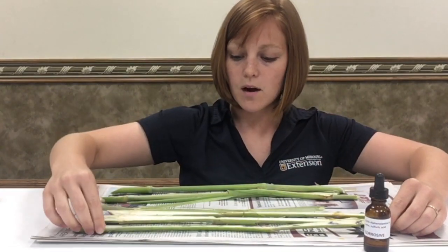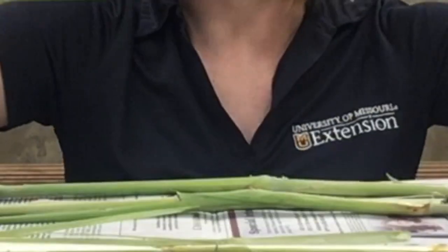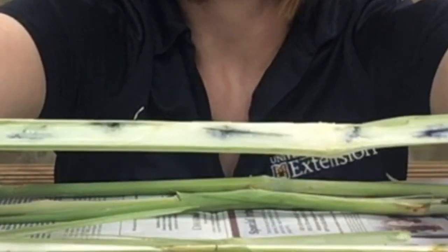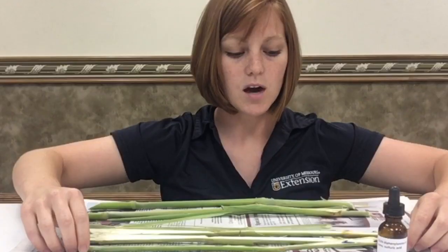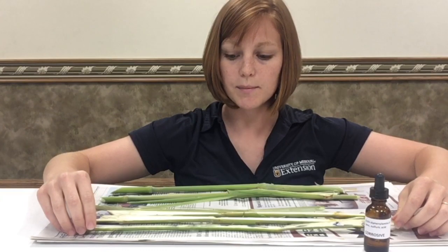Dropped it on, and it can take a few seconds, but as you can see here, this stalk is testing positive for nitrate presence and should probably be taken to a lab for quantitative analysis.